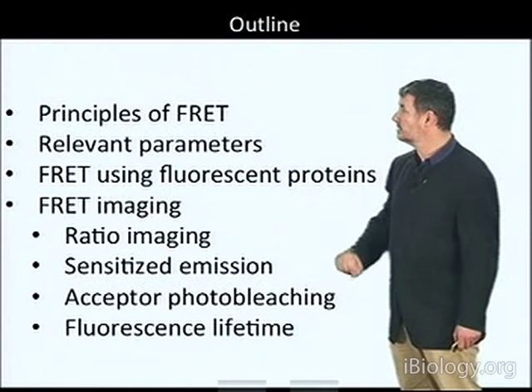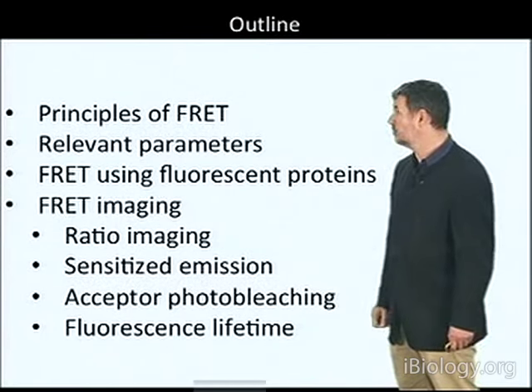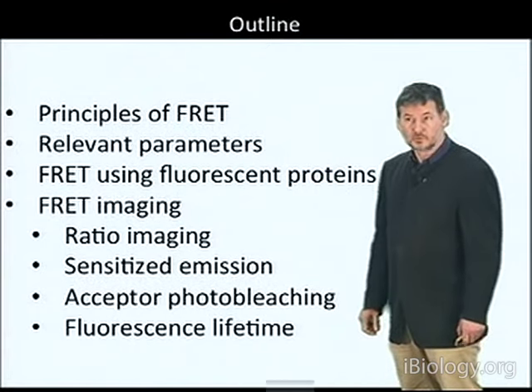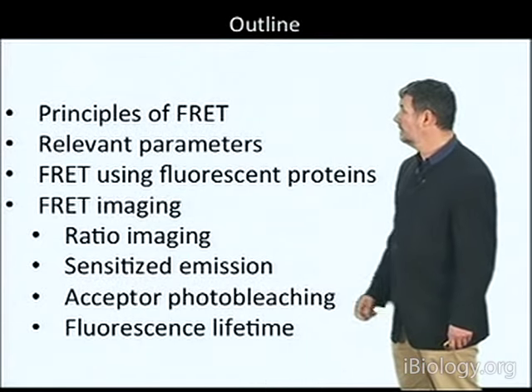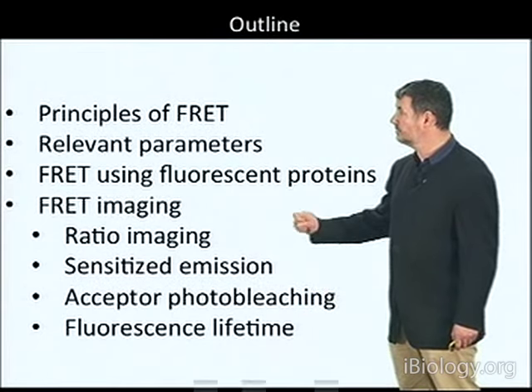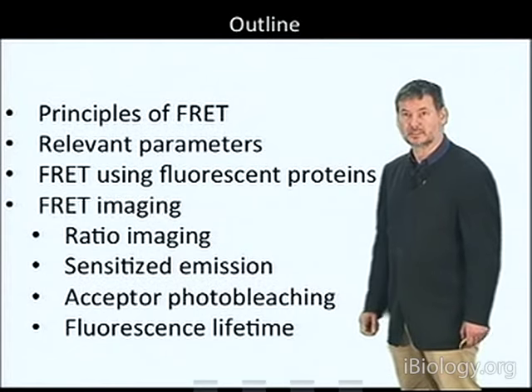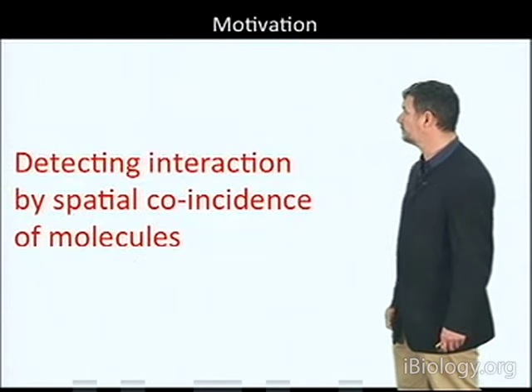I will then discuss the relevant parameters that are important to measure specific molecular interactions. I'm going to discuss shortly good fluorescent protein pairs to measure energy transfer to infer interaction. And then I'm going to discuss approaches to actually image FRET with a microscope. There's a specific order over here where I start off with the least quantitative, but the easiest way of measuring. And as we move on, it becomes more complicated, but as well, we get more quantitative information about molecular interactions in cells.